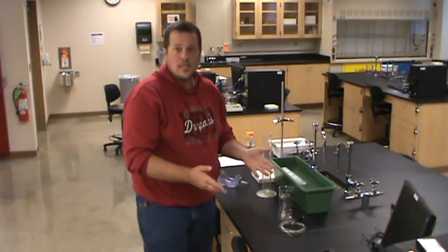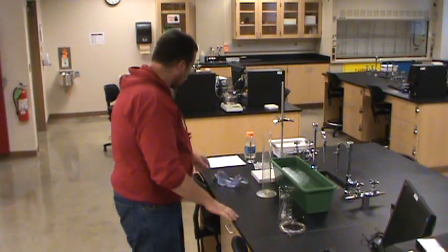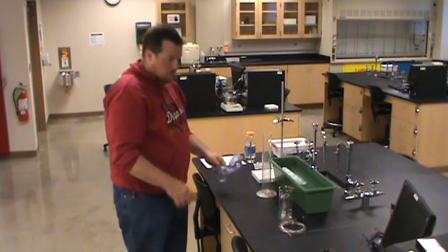I've got all the equipment we're going to need set out here. First of all, probably the most important thing — working in the lab now, so you better have safety goggles on at all times.